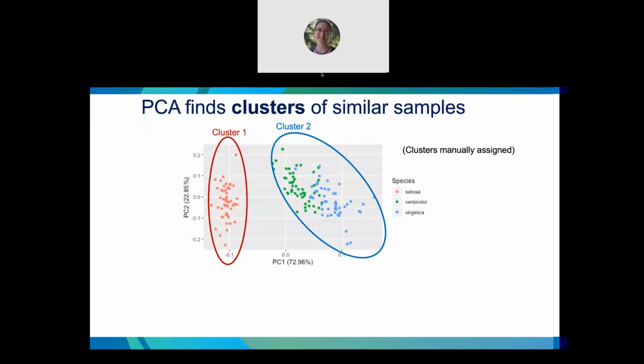So I took the same class as Nival had, and according to my notes, to calculate it first, you gotta find the direction in the data with the highest variance, and then you rotate the X and Y axis. Wait, no. Sorry, let me start from the top.